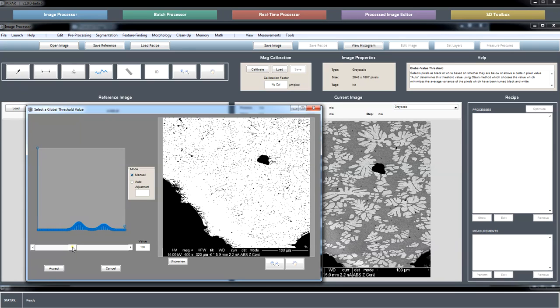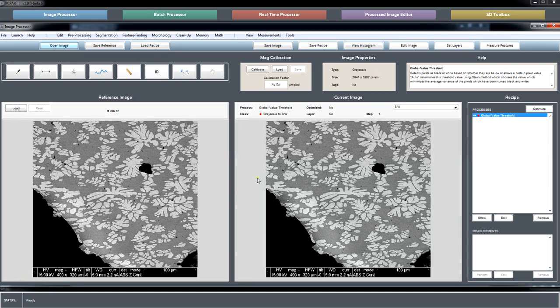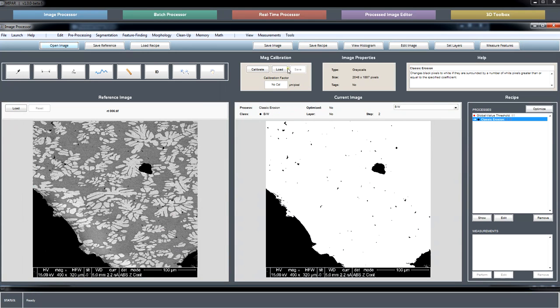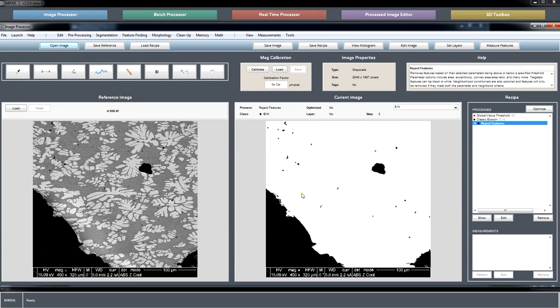So here we have, you could pick a threshold value that helps find your mask. Now we need to do a little bit of cleanup here, of course. And I mean, you may at least want to crop off the micron bar here, since it's really not one that you'd probably want to put on any publishable figure anyway.